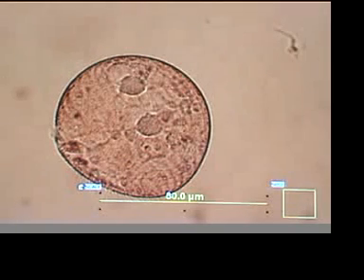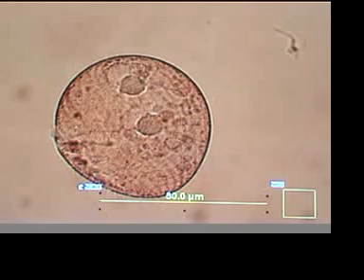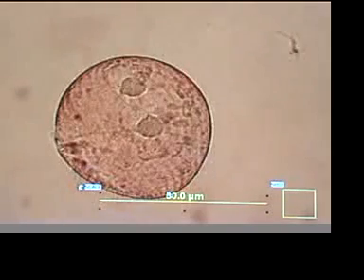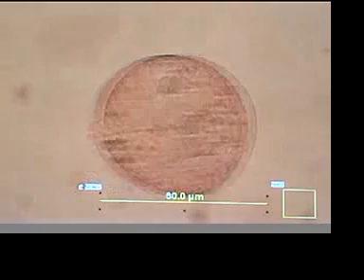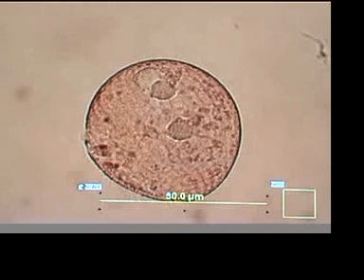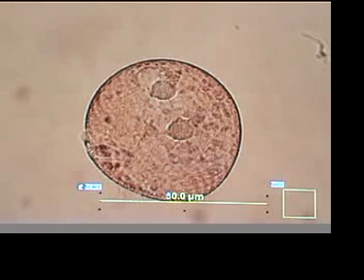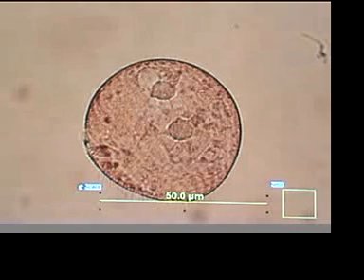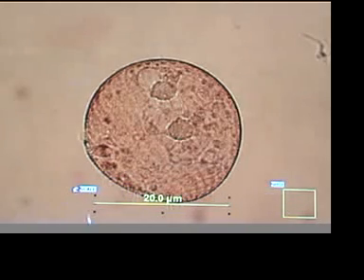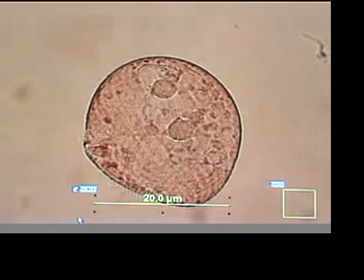Now I'm scanning the slide to see if any other organisms were affected, and I found this one. And he's so incredibly round, I'm not 100% sure, but I believe that's a Blepharisma. That would be typical, that they would be distorted into this round shape. There still is a cilia motion down there. Let me change the scale, because this must have been a smaller one. This is now accurate scale, so he's smaller than the other one we videotaped. Looks more like the moon than an active Blepharisma. Fascinating.